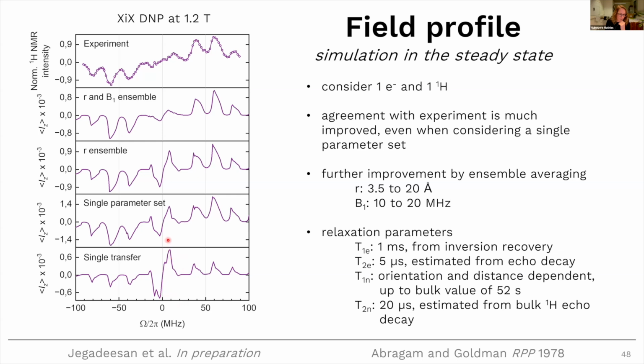This feature in the center is way too strong. The peaks are too pointy. We don't simulate what's going on here. There's intensity here. We don't reproduce that.